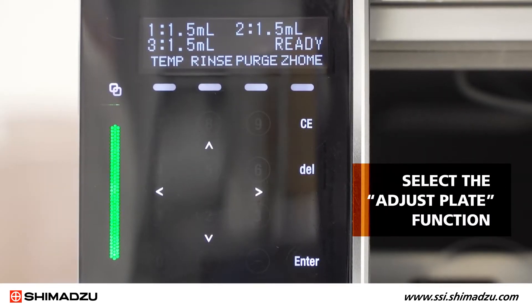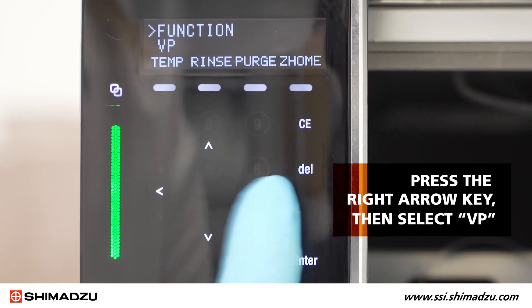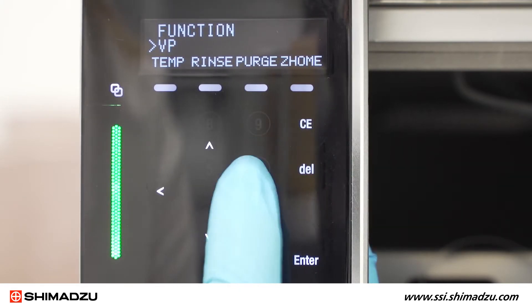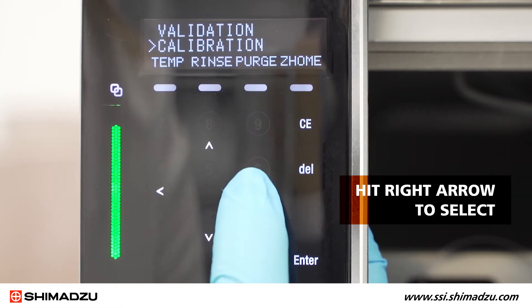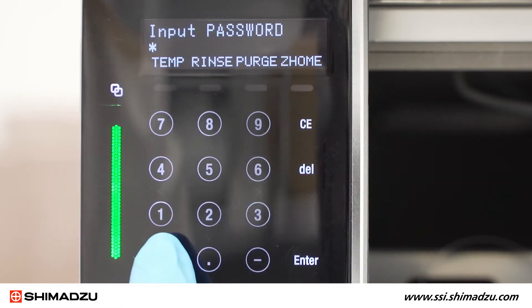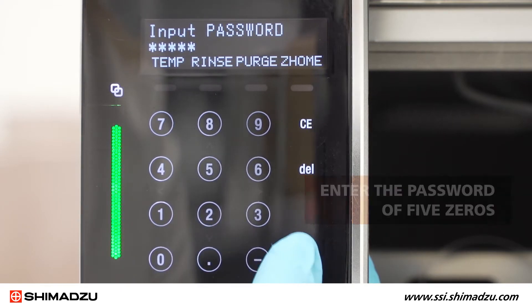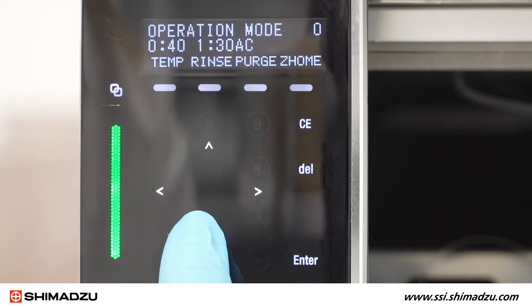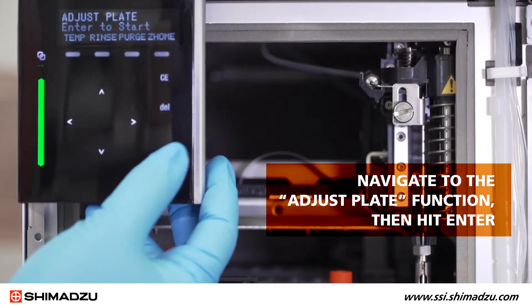Now use the keypad to select the adjust plate function. Press the right arrow key, then select VP. Use the down arrow key to scroll to the calibration menu. Hit right arrow to select and then enter the password of five zeros. Use the down arrow keys again to navigate to the adjust plate function, then hit enter.